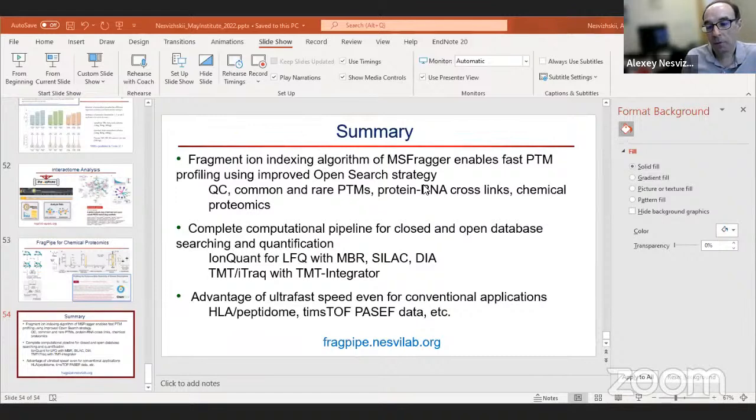Now, the price you pay is that, of course, there's a much bigger ratio suppression effect. So with MS2-based TMT analysis, if it's a tenfold biological change, you'll likely get a 2-3-fold change from TMT analysis, right? MS3 would allow you to get a more realistic, more accurate fold change. But the price you pay is the loss in the number of IDs.